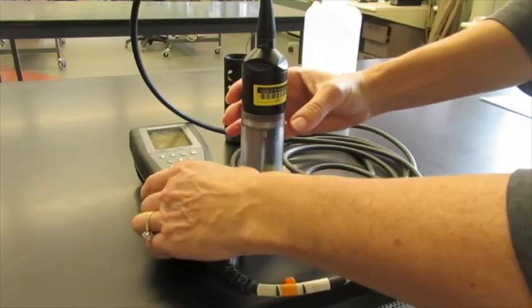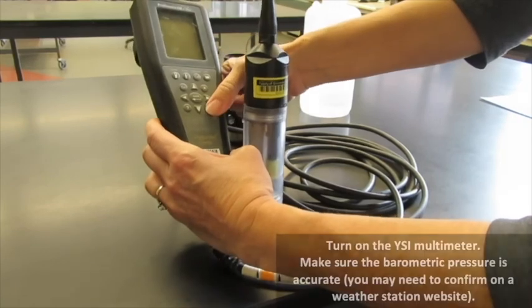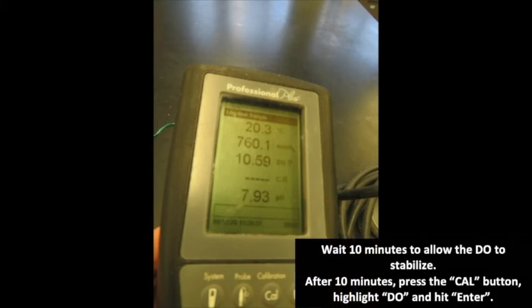That will allow for atmospheric venting. Next, turn on the YSI multimeter using the power button. You will see numerous readings: the first line is our temperature, our barometric pressure, our dissolved oxygen in milligrams per liter, a probe that is not connected, and our pH probe.